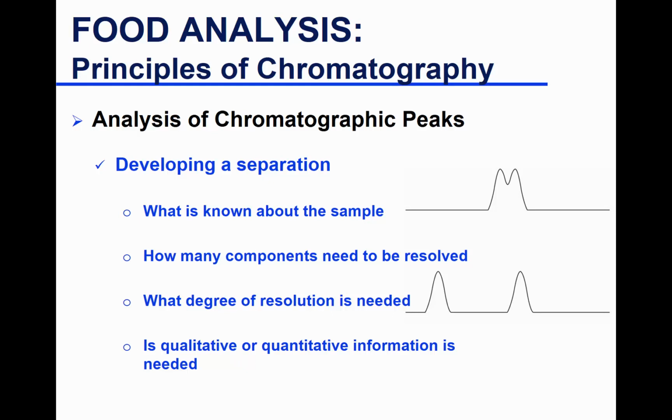We're moving into a very exciting piece, at least for me, figuring out separation and choosing a method of separation. So the ultimate goal of chromatography is to separate compounds, right? When we say separate compounds, it also means resolution of these compounds or resolution of the peaks. How well we can separate them from each other. The better we separate them, the better we're able to identify them and quantitate them.